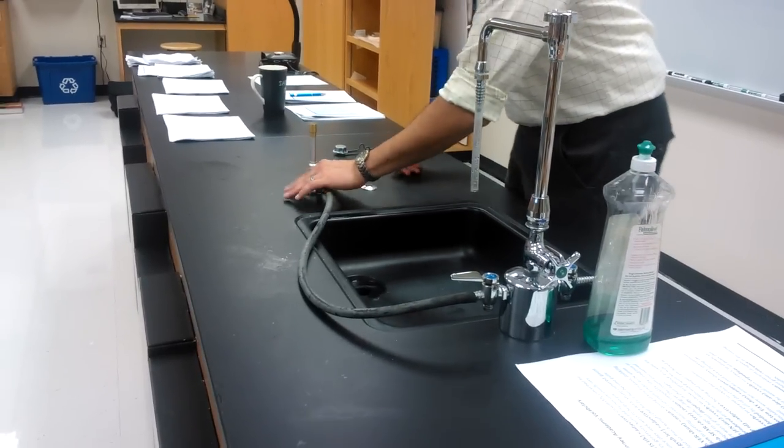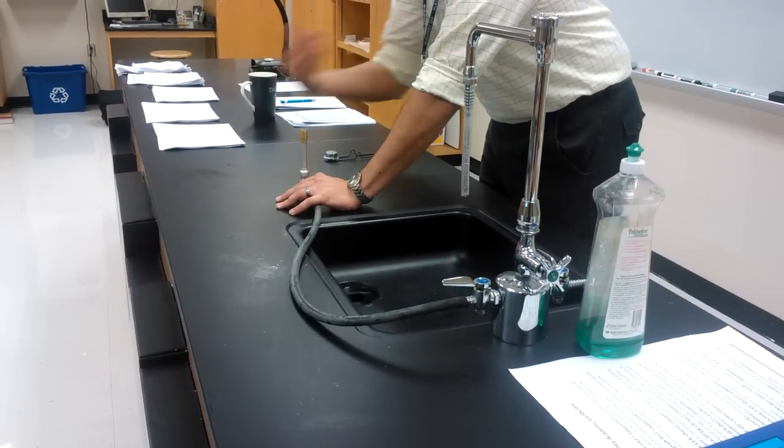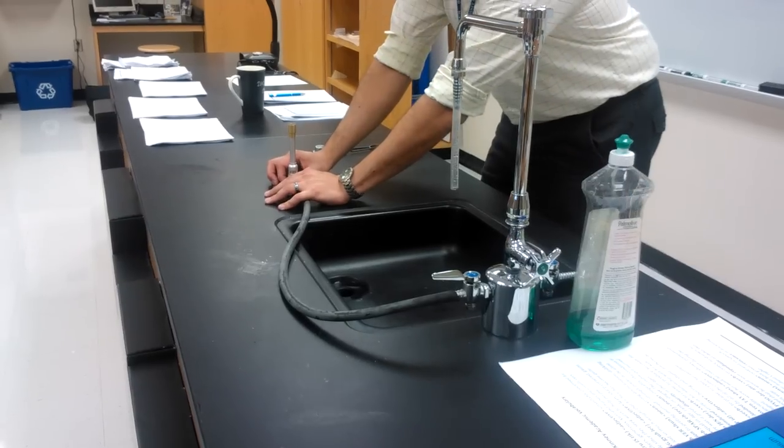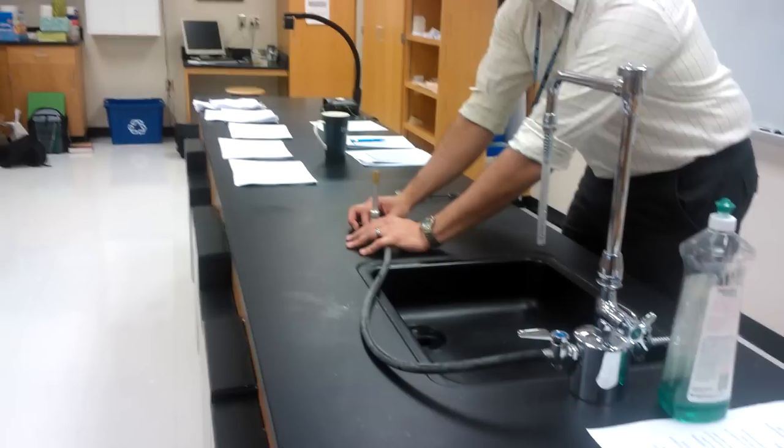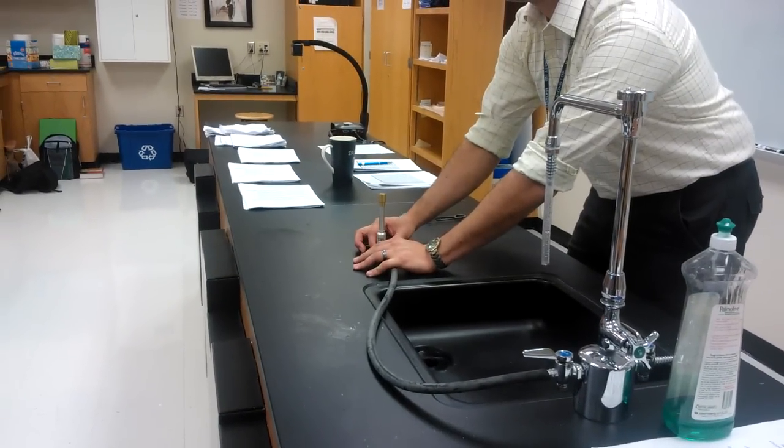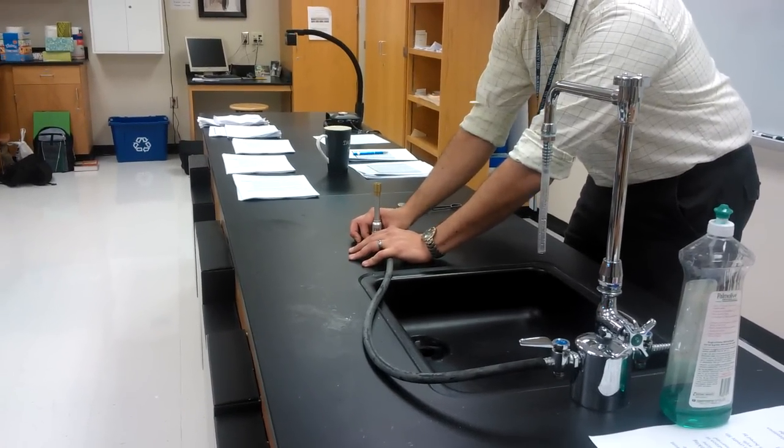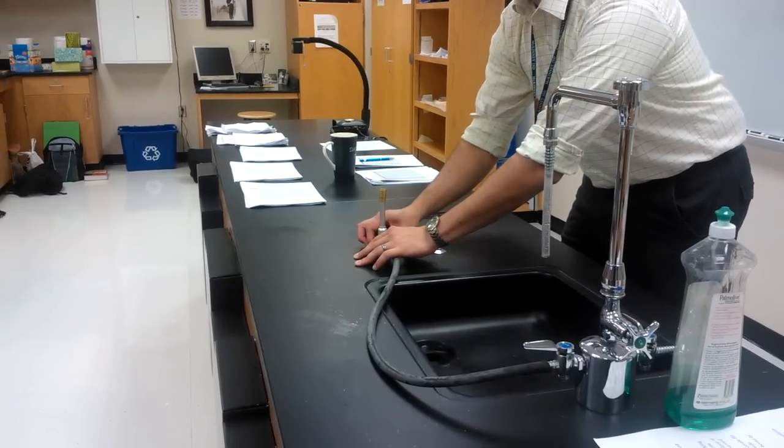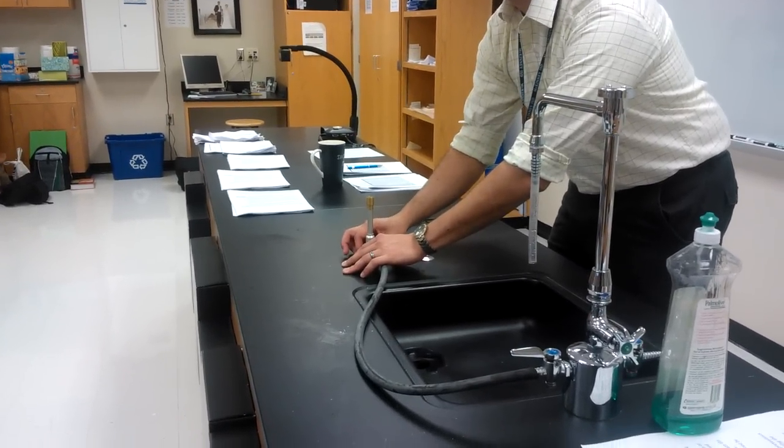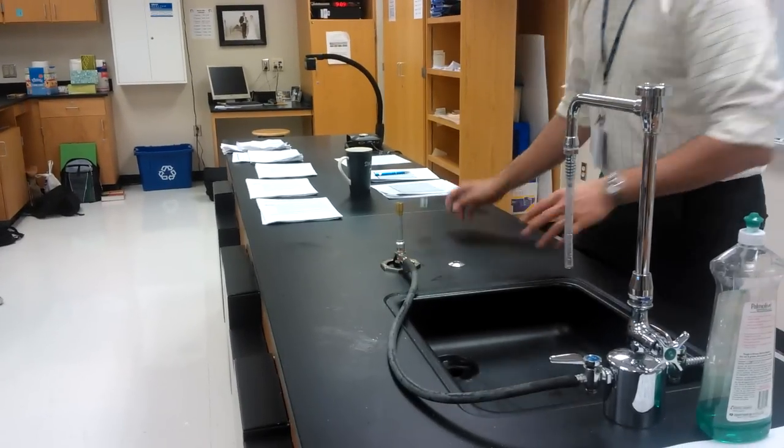So now with our hand on the base to make sure it doesn't tip over, I'm going to turn the knob to open it until I can hear some gas coming out. I can hear the gas. Now I'm going to close it again real quick because I want to show you how to properly use the striker that we're going to use to light our Bunsen burner.